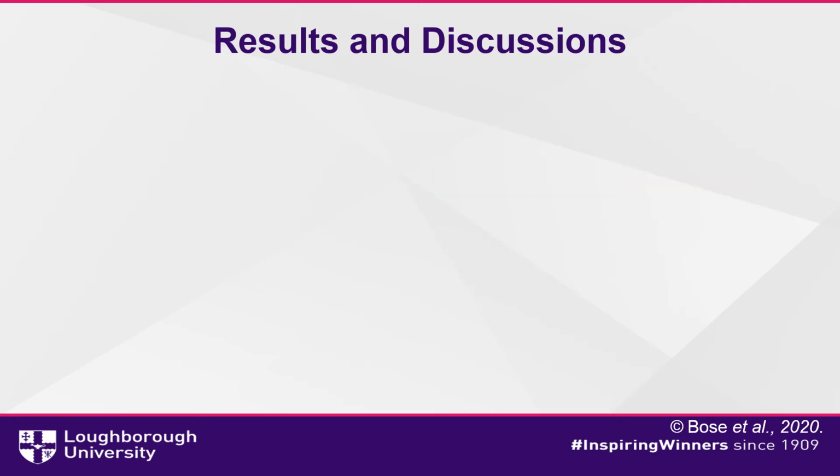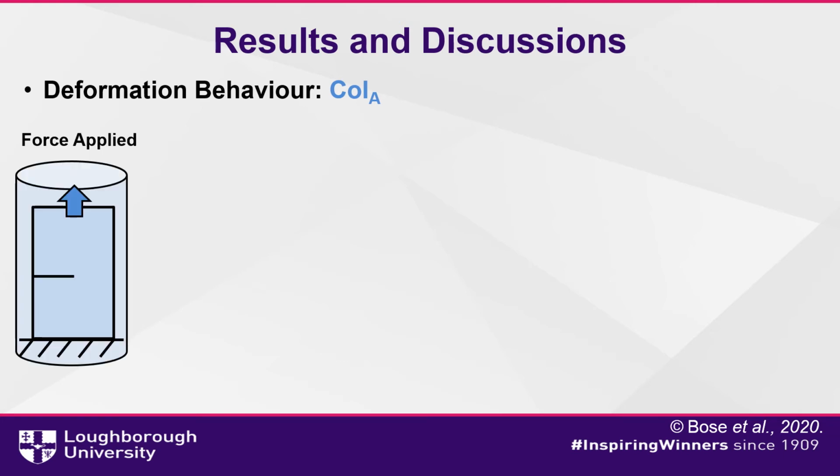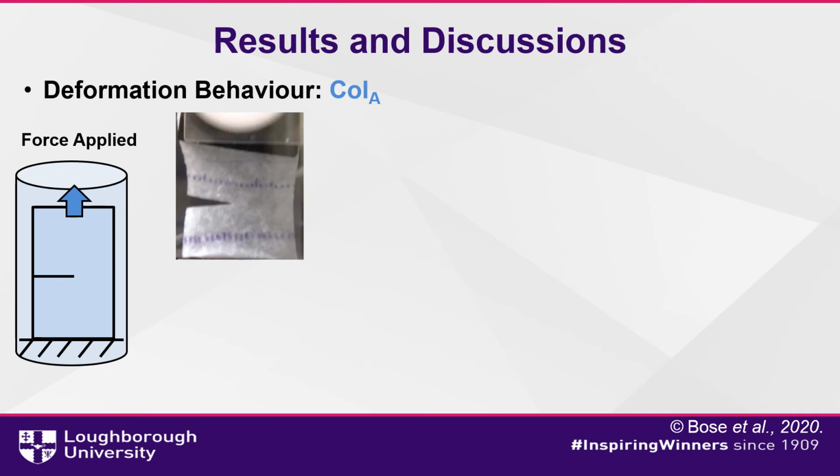Results and discussions. Deformation behavior, COLA. The schematic represents the direction of applied force in COLA specimens which are subjected to in-aqua loading environment. This figure represents the initial pre-crack introduced in the specimens.